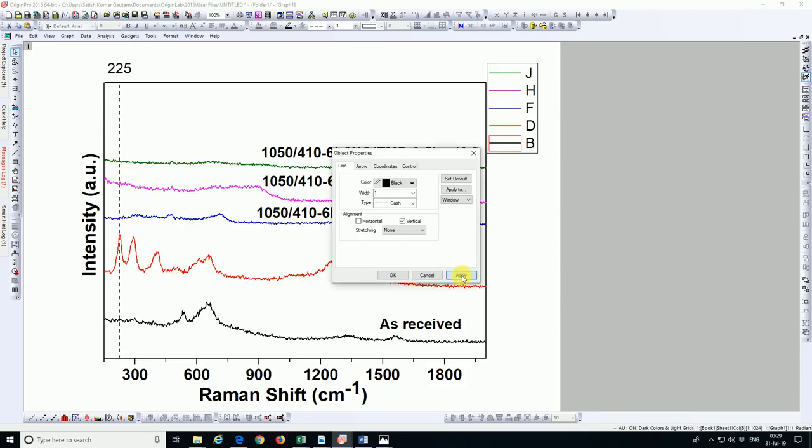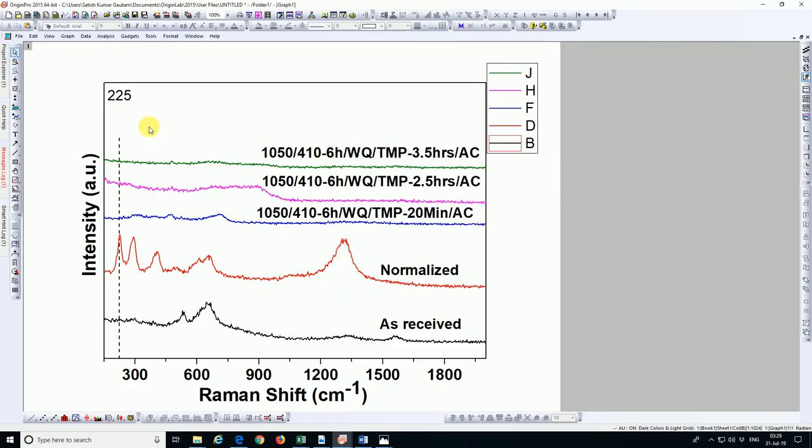Apply, go to the coordinates. Now set it to 7000. Now you can check it. It will reduce. It has been reduced. Now if you want to reduce more, you can. I want to check it for 6800. Okay, it's working. You can delete it.